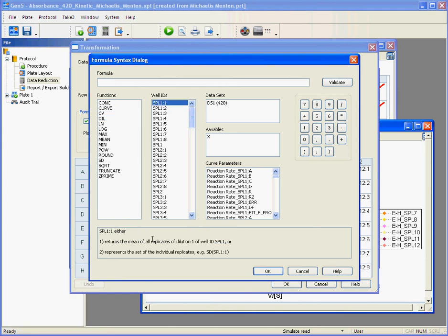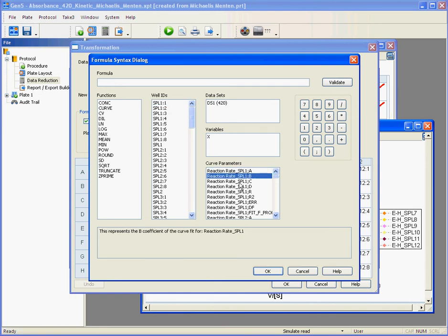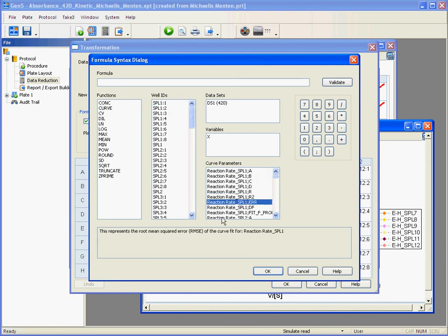Any well ID and this explains what it means, as well as any other data set available here on this dialog.